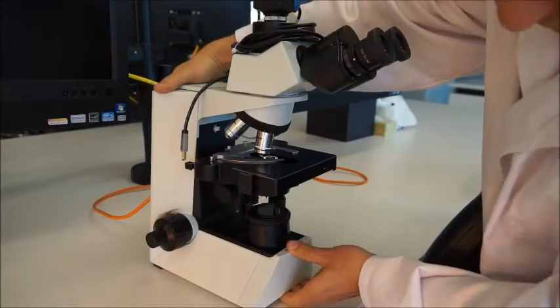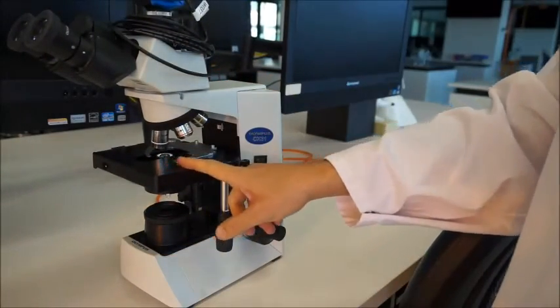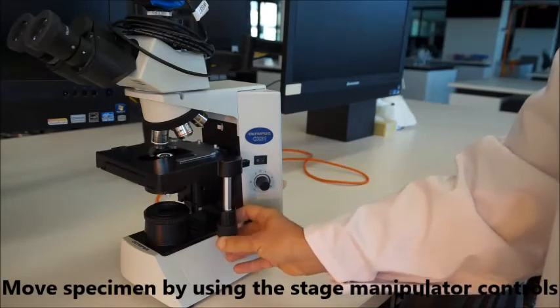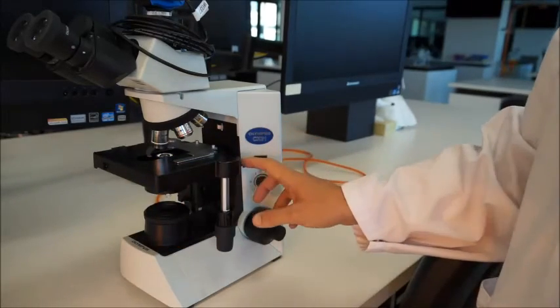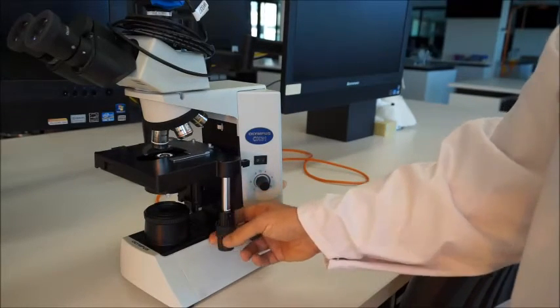When you go to move the stage around — moving your specimen around on the stage — use these manipulator controls here to move your sample back and forth. Don't grab the stage and move it directly because it's a precision instrument and it's going to get damaged if you keep doing that.